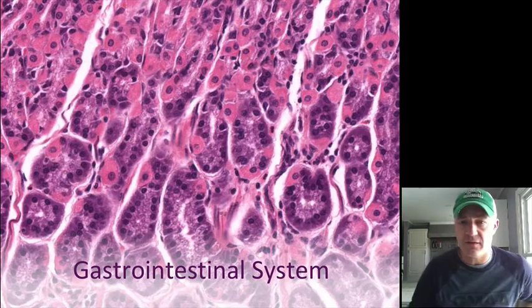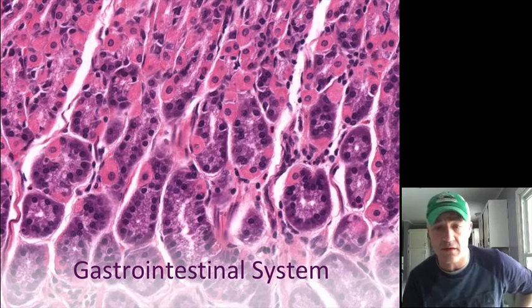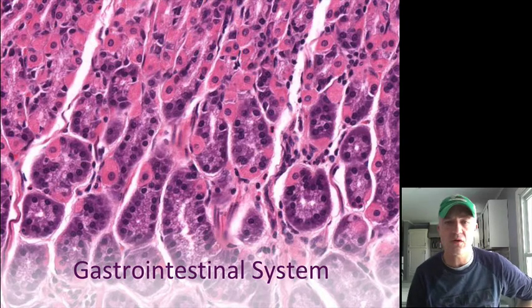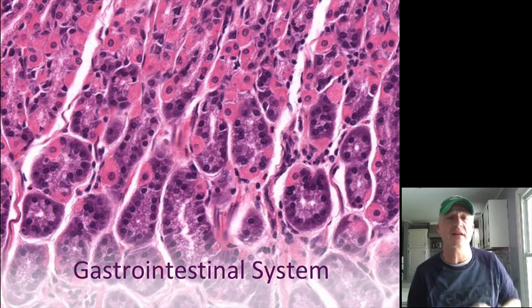Histology, we're going to move on to the digestive system, or the gastrointestinal system, if you want to go by what is on the figure here. To me, this one is a little bit more involved. We have a few more organ types, so it's a few more things to take a look at and understand what they are.